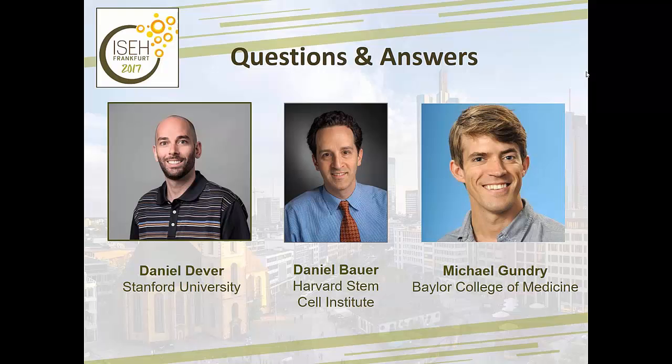The other thing is it depends on what your assay is. If it's an assay where something gets turned on, cells survive, a reporter gene is activated, it's very sensitive to find rare events. If it's more of an off assay where cells drop out, it may be harder to detect rare events in the population. So I think part of it is designing an assay that's suitable for the type of outcomes you're anticipating.